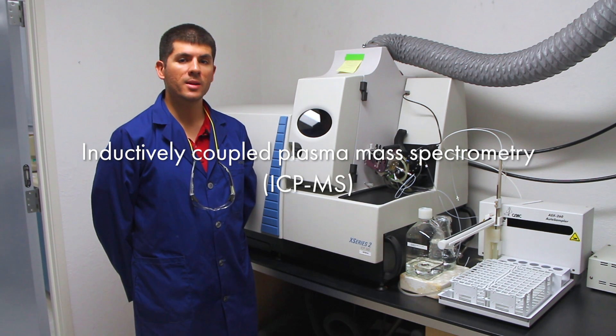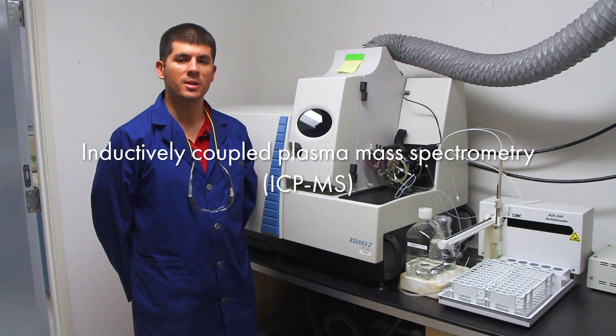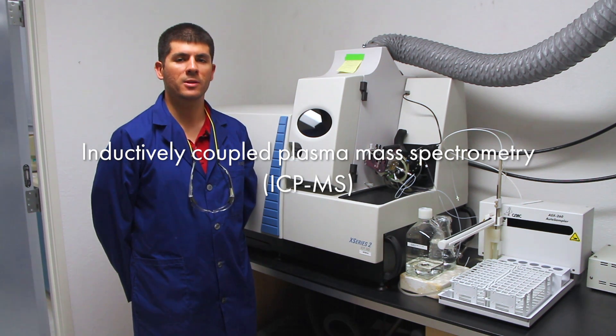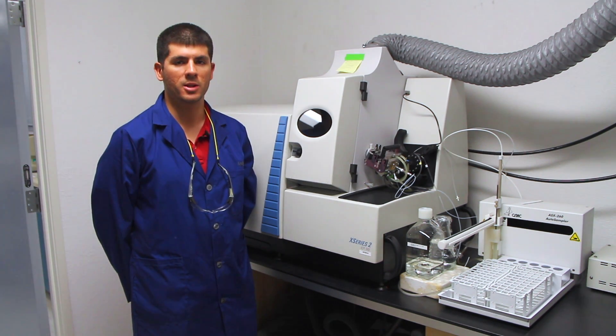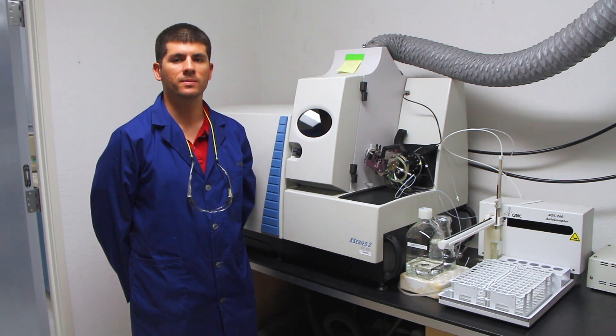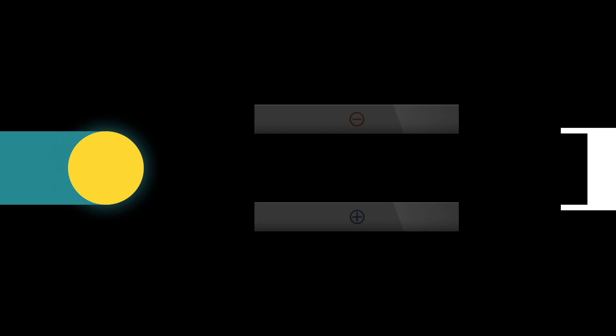ICP-MS is the most sensitive method we have to identify and measure the concentration of metals. In an ICP-MS, super-hot plasma is used to atomize samples, creating ions.